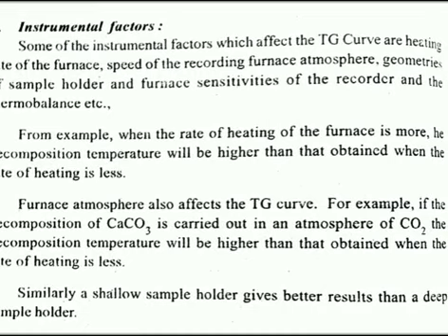And now the instrumental factors which affect the thermogravimetric curve. Some of these are the heating rate of the furnace, speed of the recorder, furnace atmosphere, geometry of the sample holder, and the sensitivities of the recorder and the thermobalance. For example, when the rate of heating of the furnace is more, the decomposition temperature will be higher than that obtained when the rate of heating is less.